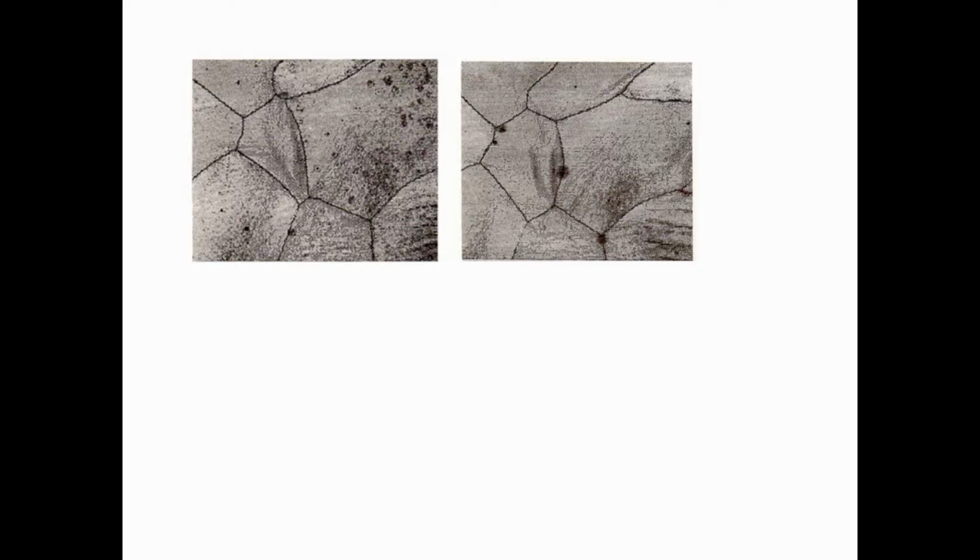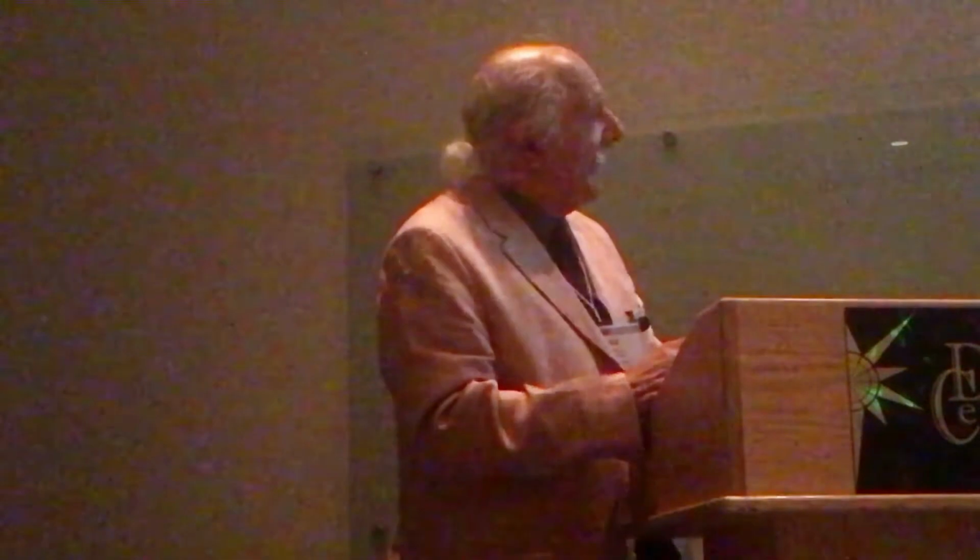And those two there are semi-quantitative. It gives you a bit of a feel for where it's badly damaged or lightly damaged. But one wants quantitative information, and that's this term, high-resolution electron backscattered diffraction. And that's what I'm going to talk about in this talk.